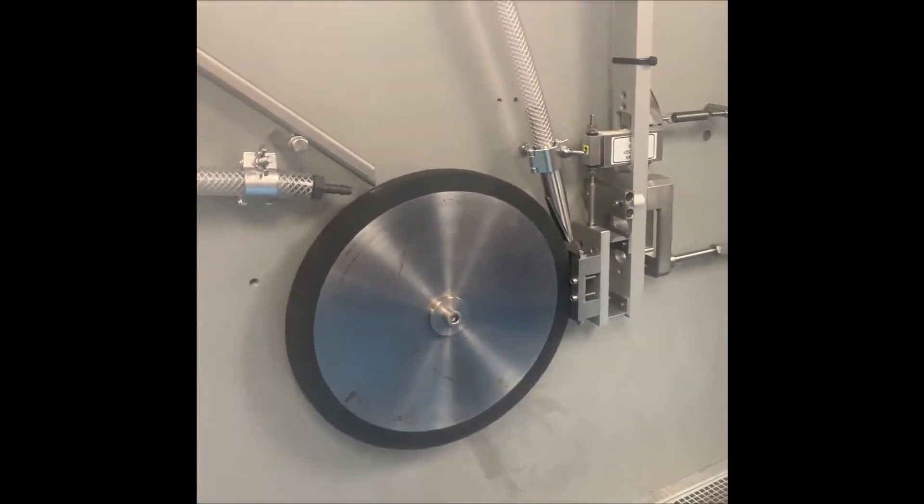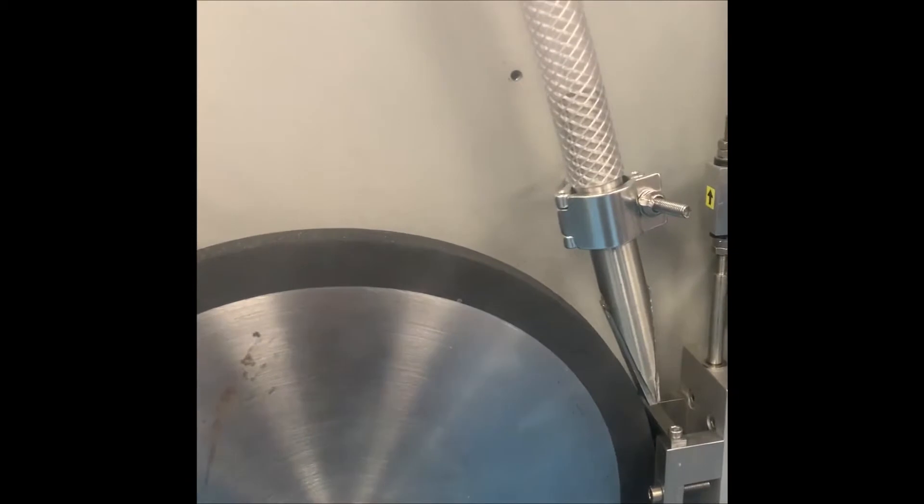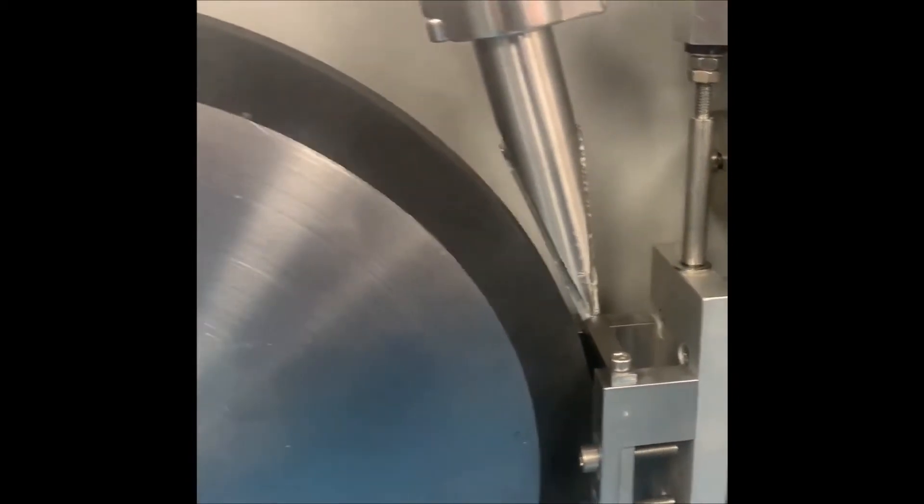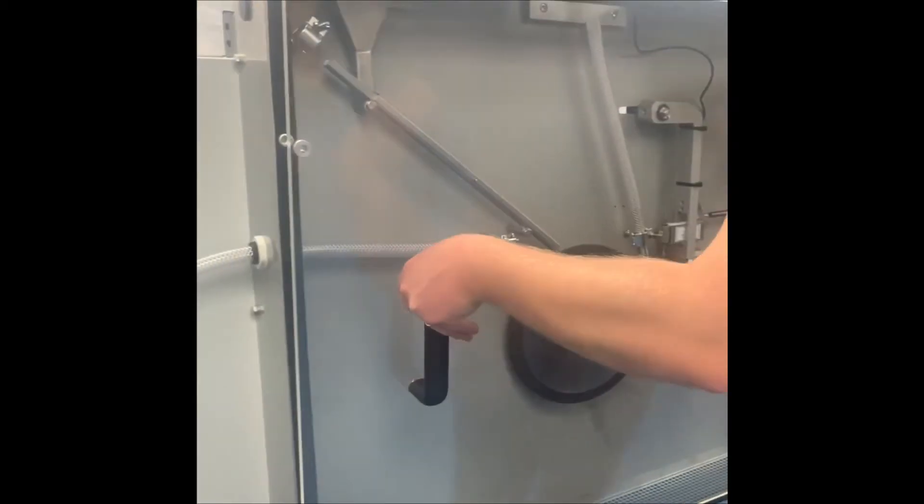For a dry sand and rubber wheel experiment, adjust the position of the abradant feed nozzle close to the surface of the wheel and above the inlet to the contact. Fit the guard and secure with the knobs provided.